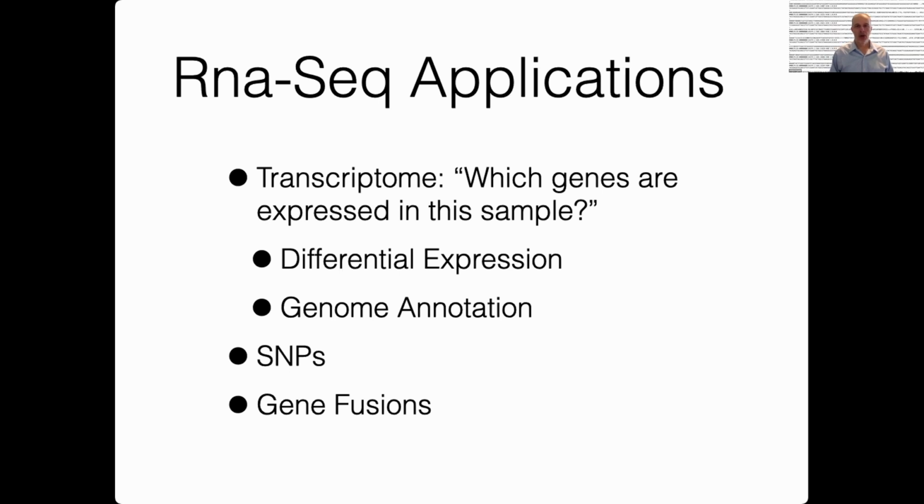And I want to know what genes are being expressed at a higher level in my treatment sample than in my control sample, and what genes are being expressed at a lower level in my treatment sample than my control sample. And I can get more detailed. I can say, okay, what's the relative change in expression level, things like that.